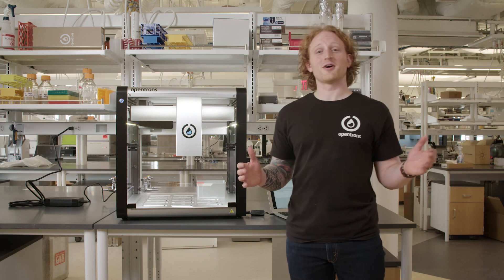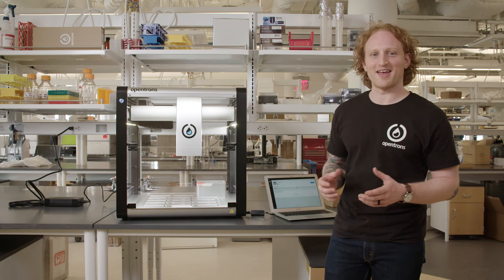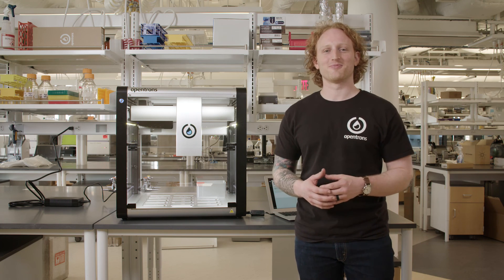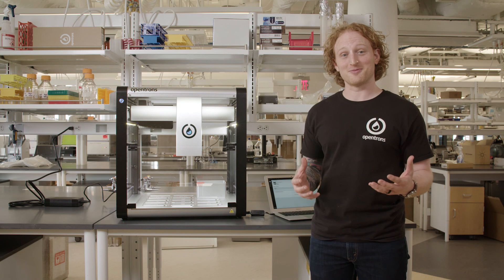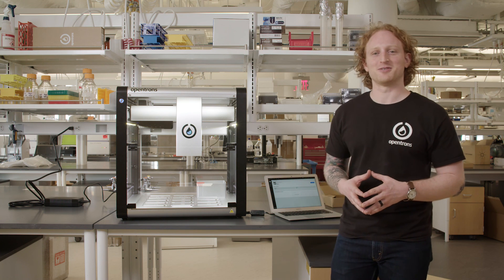This concludes our video on setting up the OpenTRONS app and connecting to the OT2. Thanks for checking out the third video in our From Box to Protocol series. Now that I've connected to the OT2, I will move on to attaching the pipettes and calibrating the machine.